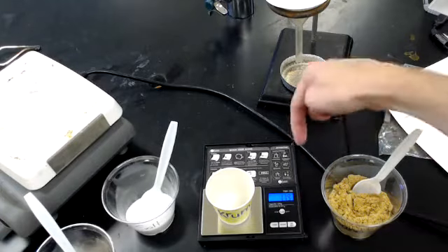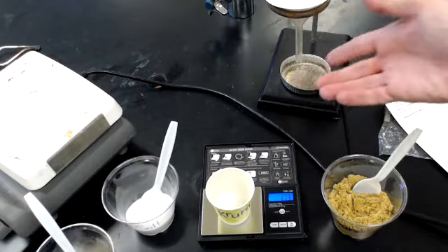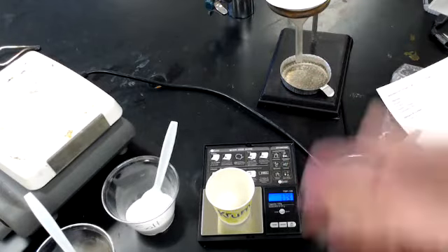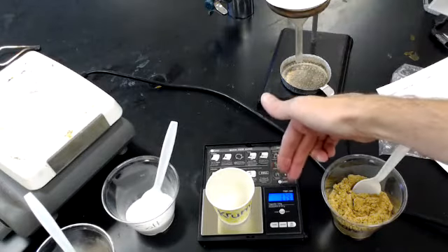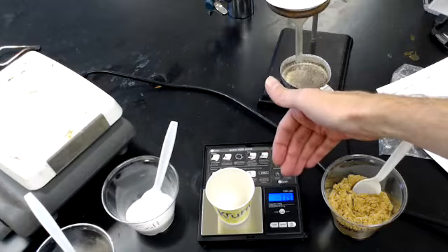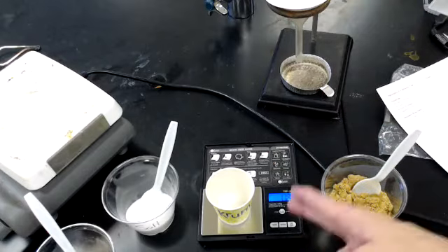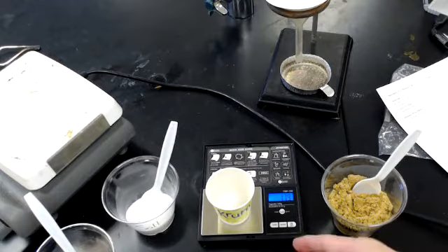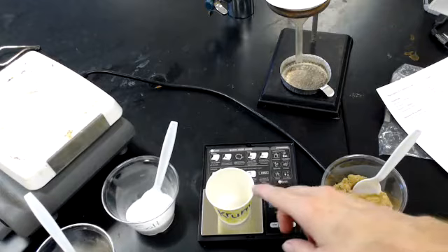So the electronic balance goes to the hundredths place, 1.79. That's all an electronic balance tells us. There's no estimating digit, because it's already estimating. So 1.79. Don't forget the label. All our numbers today from this balance should have a label, and I'm measuring mass, so be sure you put the right label on. That'd be grams.